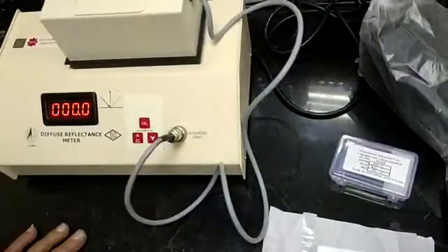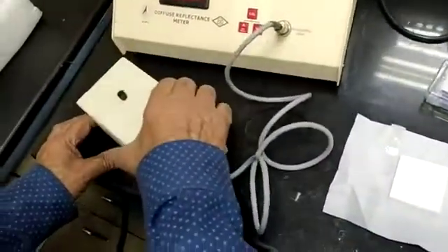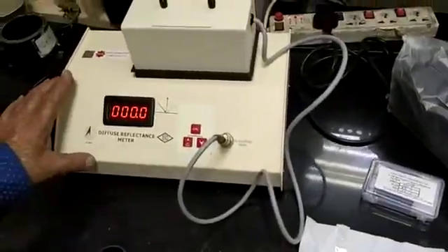Now this instrument is ready for calibration. This is a powder tray. Since it is powder, you can add it up to its border level. After applying it to the level, you can use the sample and measure. This is the complete demonstration of the latest model reflectometer. Thank you.